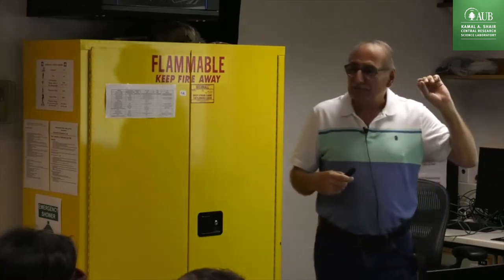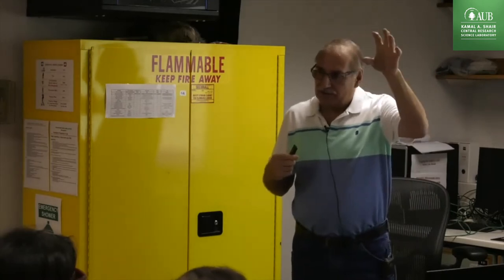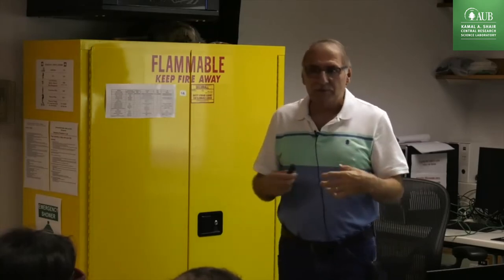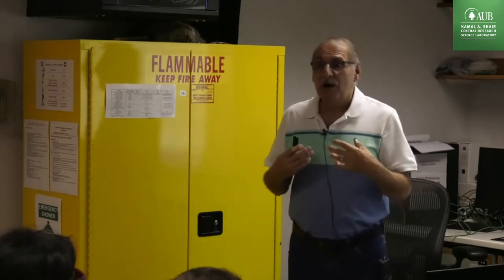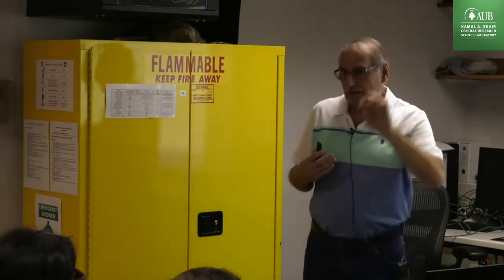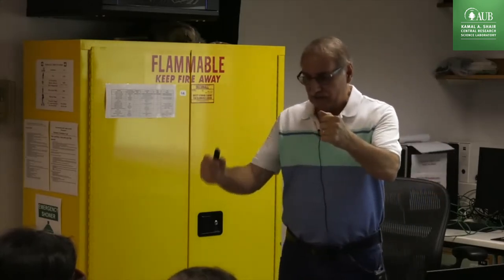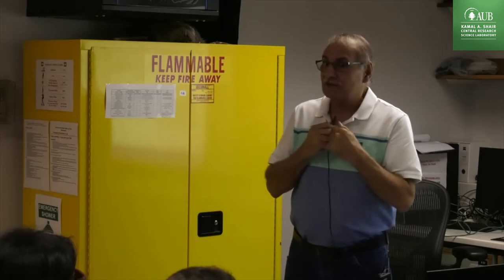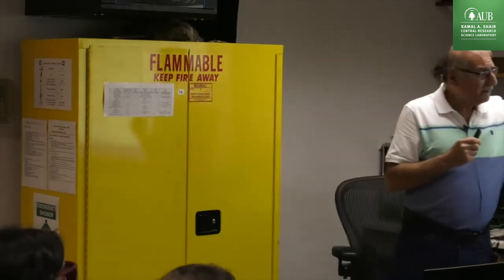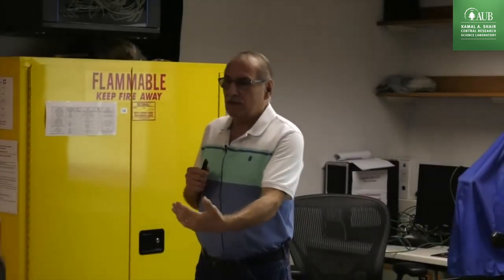So the stoichiometry factor, in this case, the relationship between the molecule, the adsorbate, and the atoms, is called a stoichiometry factor. When you read the papers on catalysis, they're going to speak about a stoichiometry factor. For CO, it is 1:1. One CO to one active site. For the hydrogen, it's 2, because one molecule of hydrogen has 2 atoms of hydrogen, and each atom of hydrogen adsorbs over nickel. So the stoichiometry factor is 2. So whatever we get from the hydrogen chemisorption, we multiply by 2, and this gives us the amount of nickel we have on the surface.